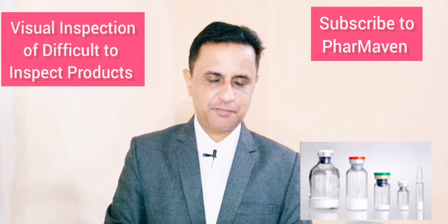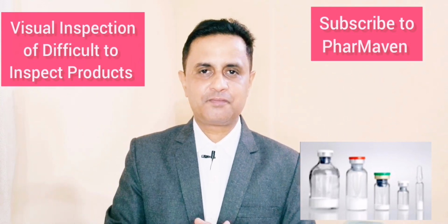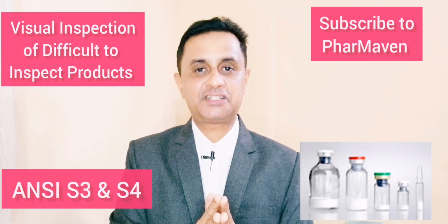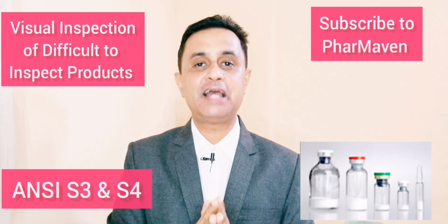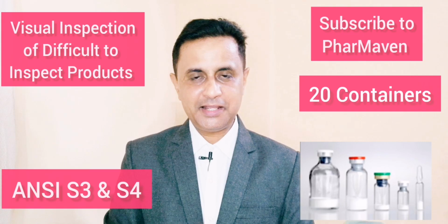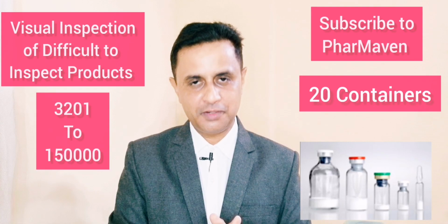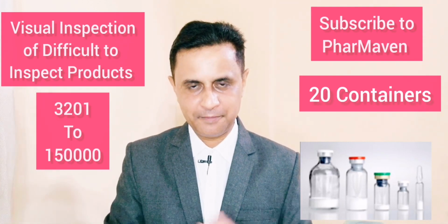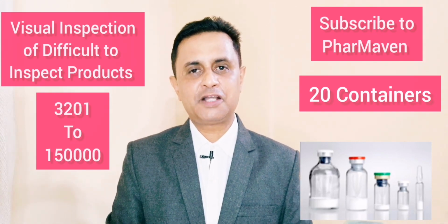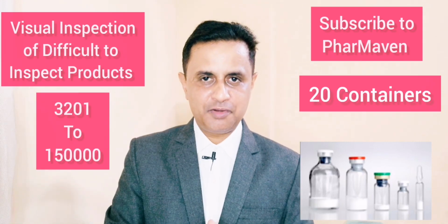As part of the inspection process, we have to inspect the external surface, what is visible to us. Above and beyond that, what we can do is statistical sampling as per the S3 and S4 sampling levels as per the ANSI guideline. That guideline allows that we can take 20 containers when our batch size ranges from 3,201 to 1,50,000. I am repeating, for the batch size of 3,201 to 1.5 lakhs, we can have 20 samples collected. We have to reconstitute those samples.